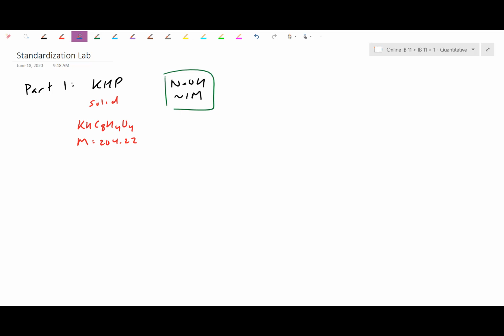So let's see if we can do this problem here. If I started off with our beaker, we poured in a little bit of mass here. I want to figure out how many grams I would need so that by the time the volume is actually 100.00, after we transfer into the volumetric, what would I need to have enough powder for this concentration to be 0.800. There's nothing magical about that 0.800. I just want it to be close to 1 molar. So let's just practice through this calculation here.